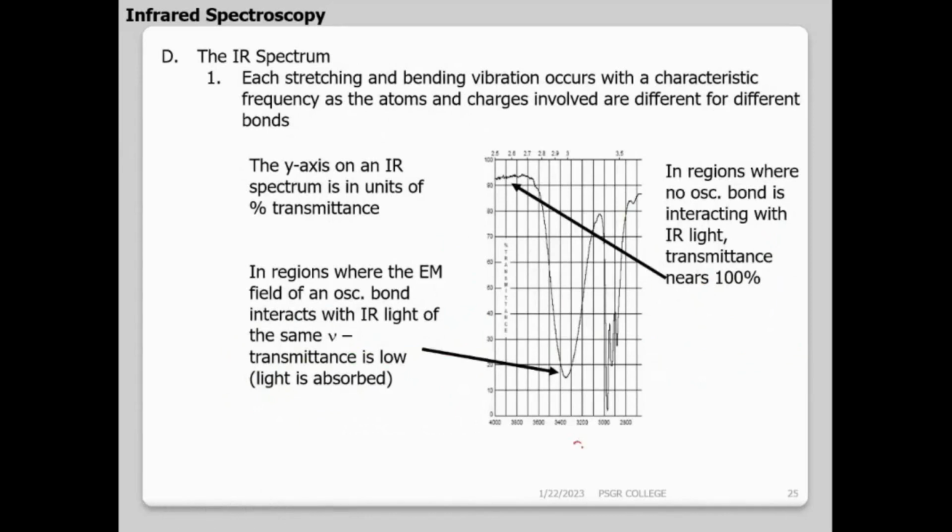I'll have the mu bar on the x scale, and the percentage transmittance on the y axis. So wave number on the x axis and transmittance on the y axis. Okay, now generally I go for percentage transmittance, so it will come as an inverted curve.